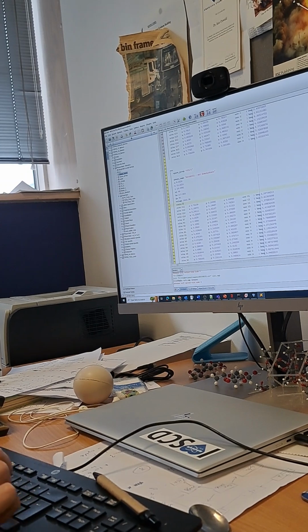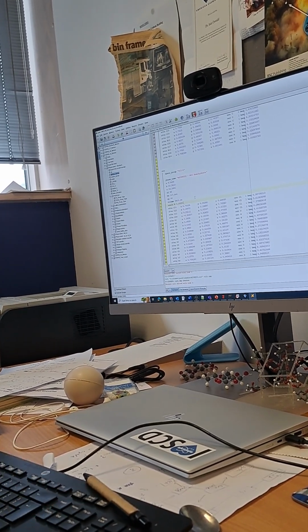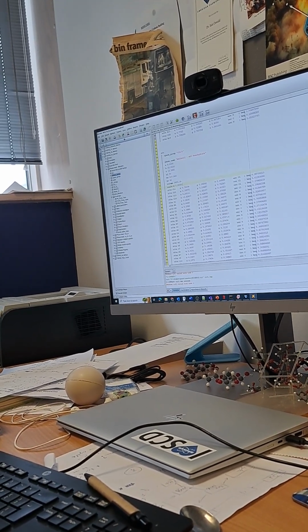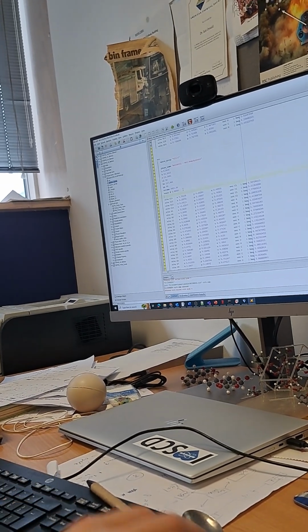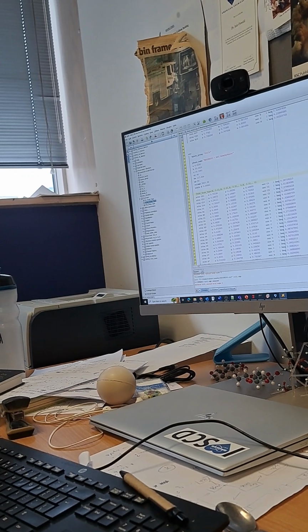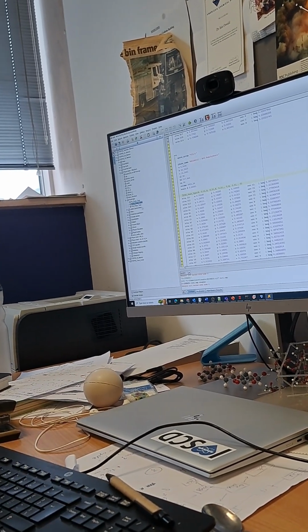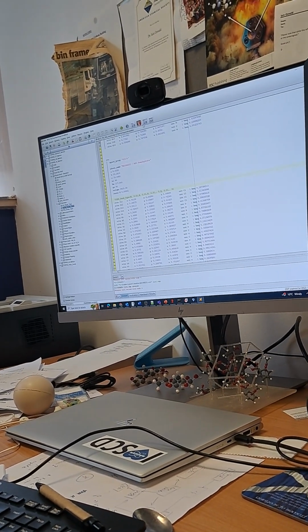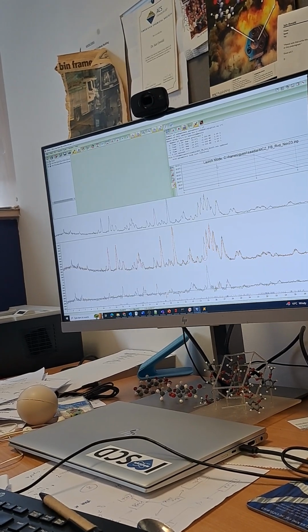Okay, so what was that level? That was about 1, something like that. Okay, so we've got our scale factor for this thing. What else do we need to think about? We could do this as well. We'll just do that for the moment, just to get us set, and then we can get into it. Other parameters we've got, site we've got. Okay, we've got everything we need now, so we can click on Topaz and then run again.